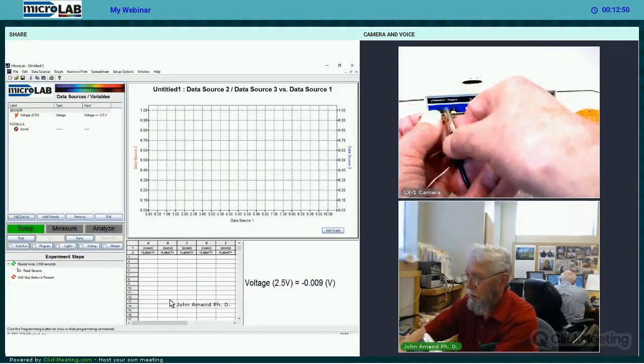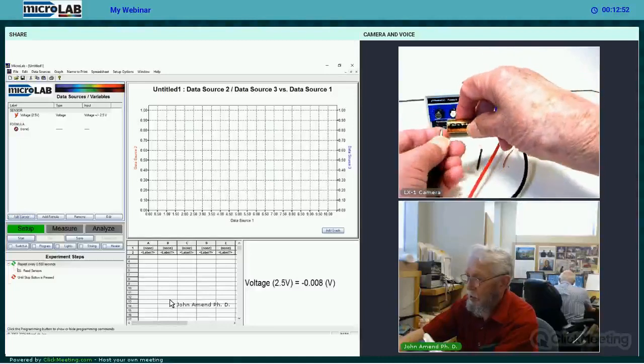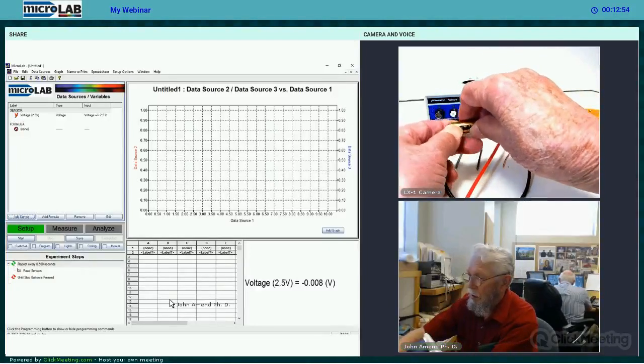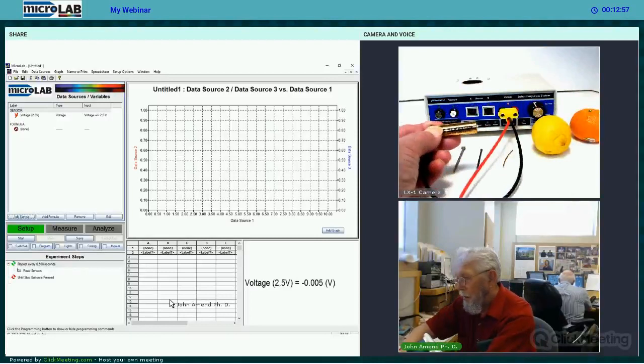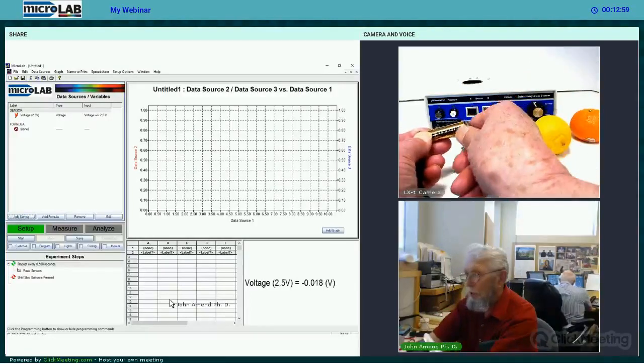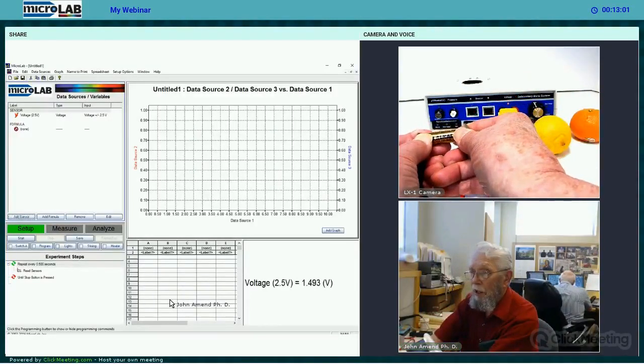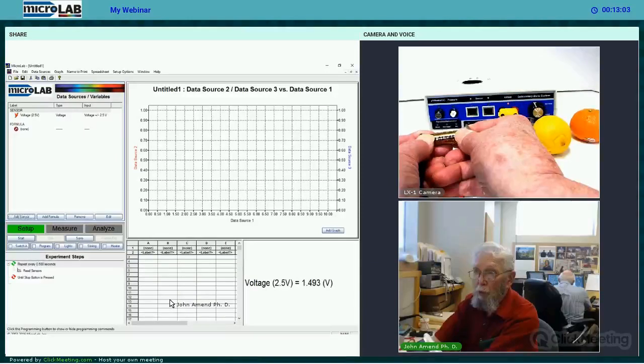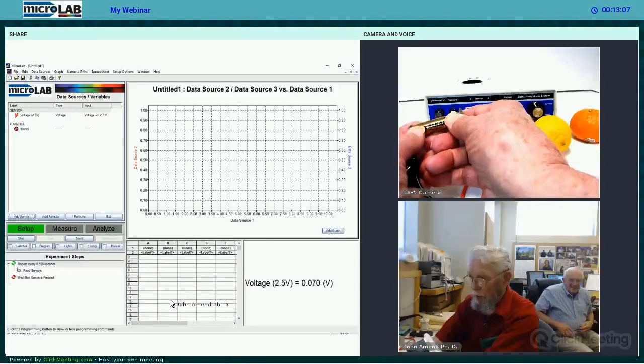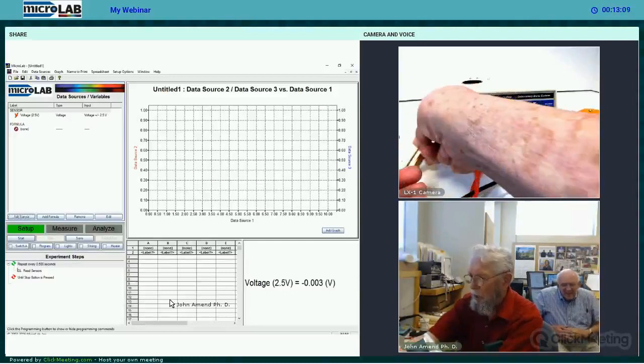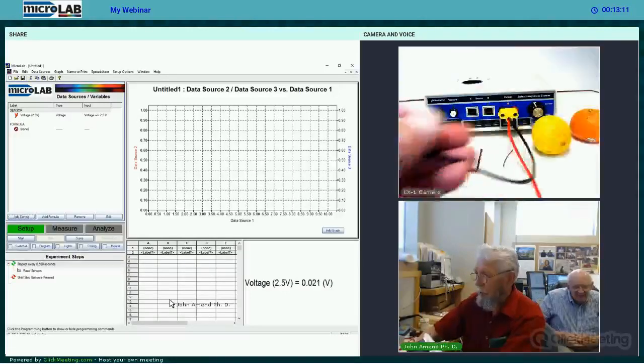And we'll try to get some contacts on this little cell. The black one to the negative, and the red one to the positive. And indeed, we wind up with 1.493 volts. So you know, the machine is working.